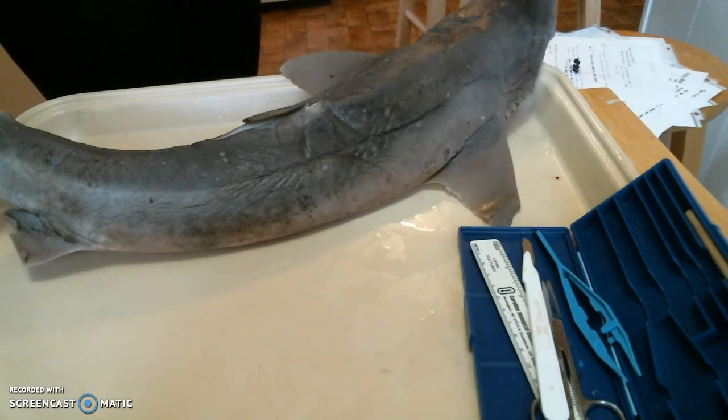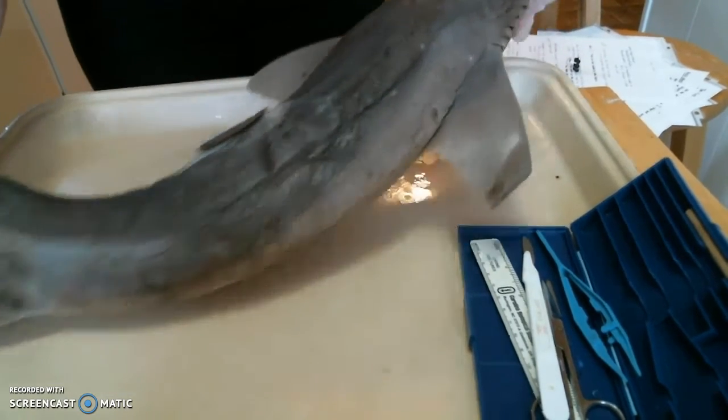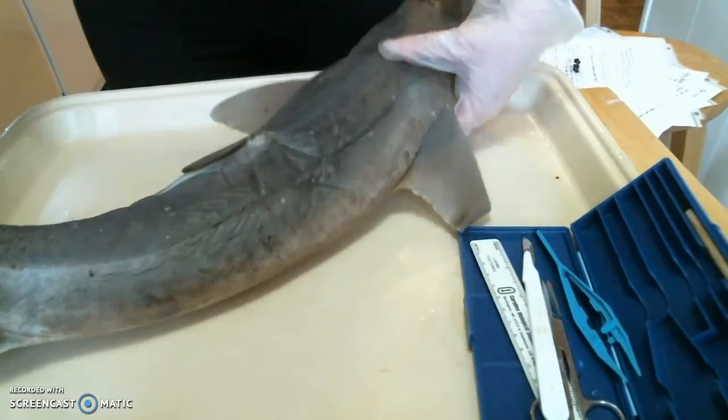It does say to have them look at the tongue. I don't know how you're going to get in the mouth and look at the tongue. It does have gills. I think there should be 5. 1, 2, 3, 4, 5. Yep. So we can have them examine all that for like 10 minutes.